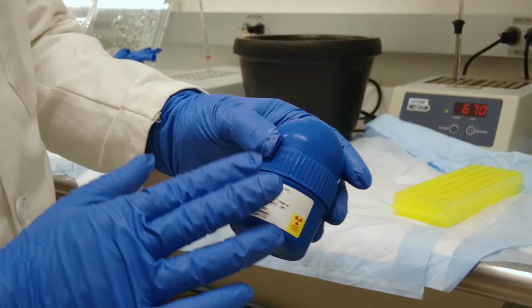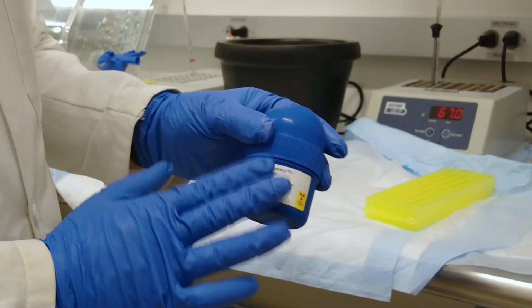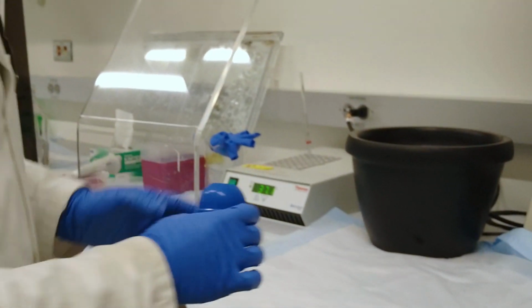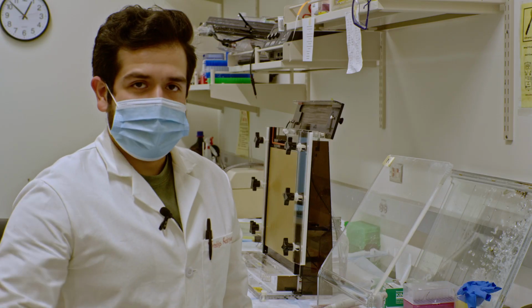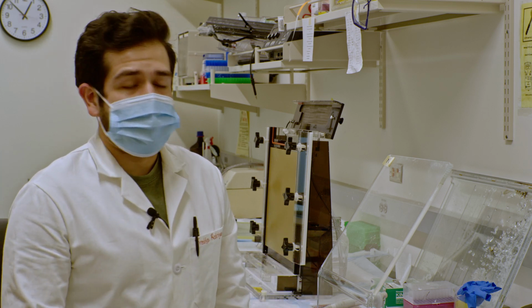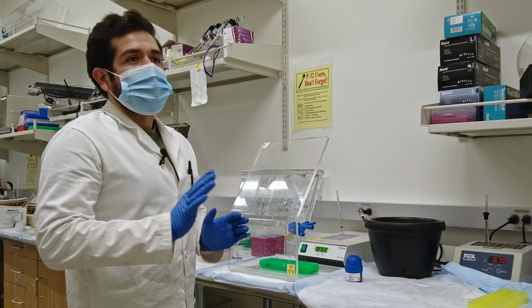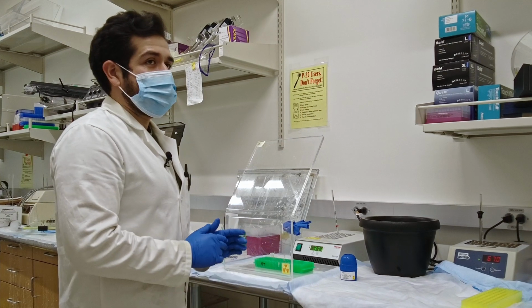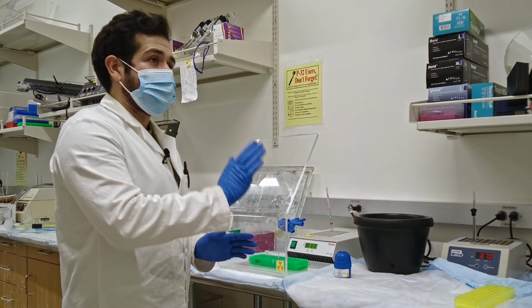This will tell you how many half-lives this radioactive ATP has been through. The half-life of radioactive ATP is about 2 weeks. So to get the nicest data you can, try to use it within the first 2 weeks of purchase. You can use it up to a month after purchase, but after that, I would not recommend it. The gels that I've done that have used past month-old radioactive ATP look awful. So you'll want to get this whenever you absolutely are ready to do these radioactive assays.